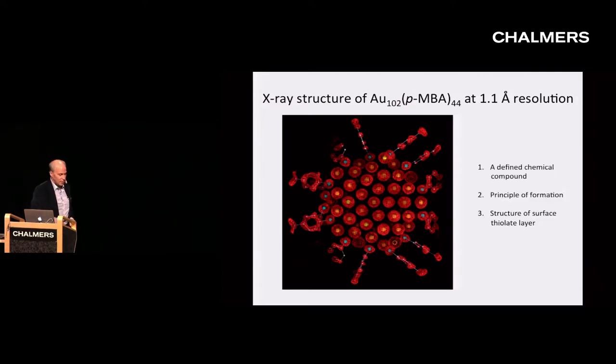I must say, I thought when I saw it, this was the most beautiful structure I ever saw. It still is, but more importantly, it is still the only structure of a large metal nanoparticle, and therefore what principles we can derive from its study are of general interest. And the first point, contrary to what we had feared, this is a compound of a precise composition.